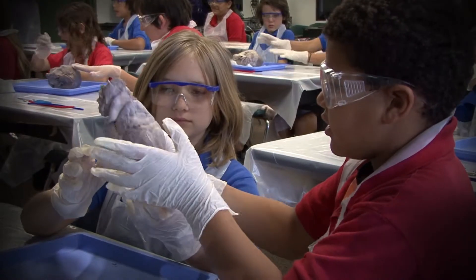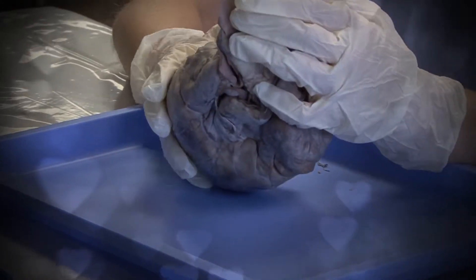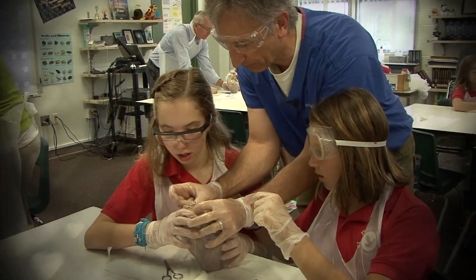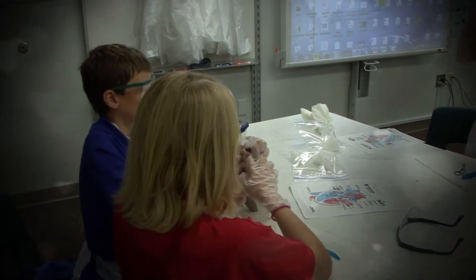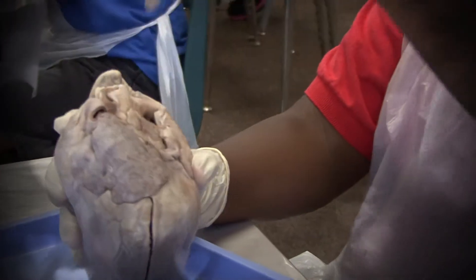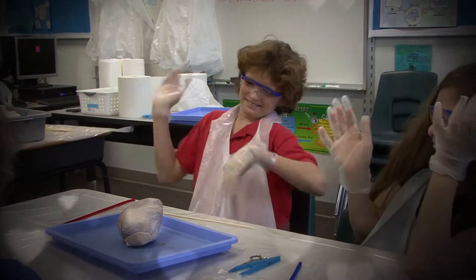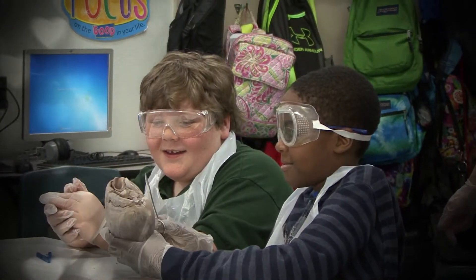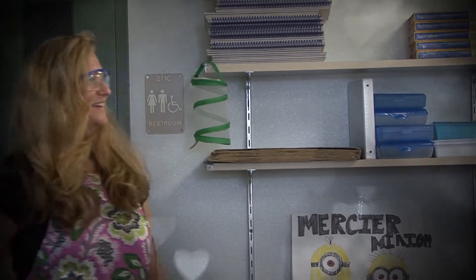Without opening the heart, I want you to look at it, observe it, see all the different vessels. Who can tell me something that they see? The aorta.